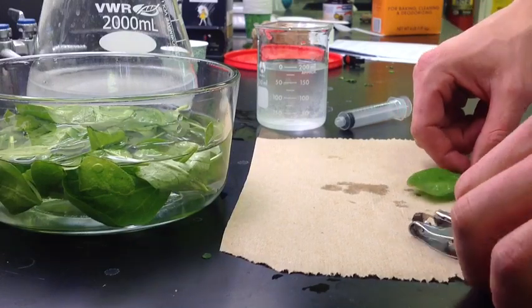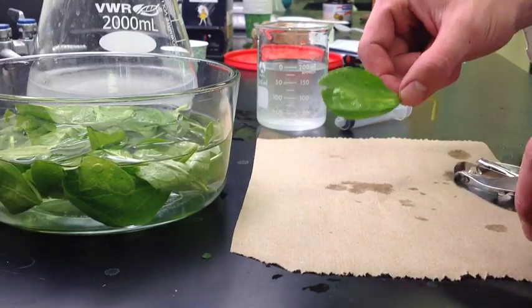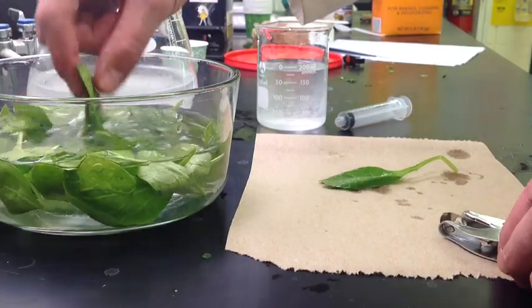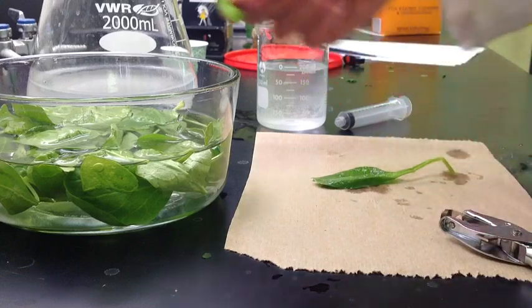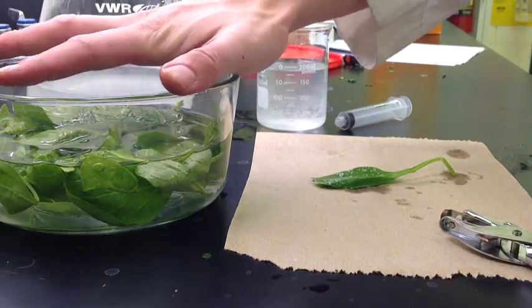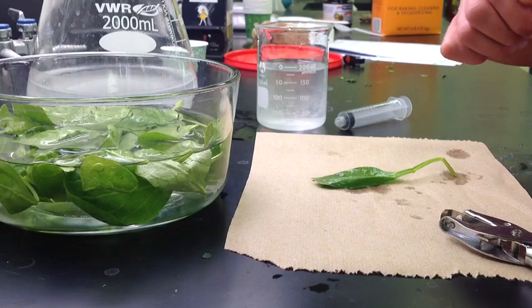To begin this lab, we are going to make 20 discs from a spinach leaf. The darker spinach leaves are better than the lighter colored ones — I chose the darker color because it will work better. Your instructor should be soaking the spinach leaves in water overnight, as this will make the experiment work a lot more effectively.